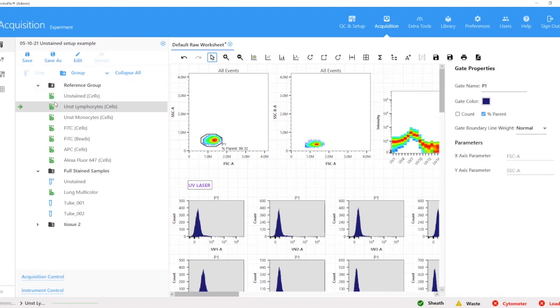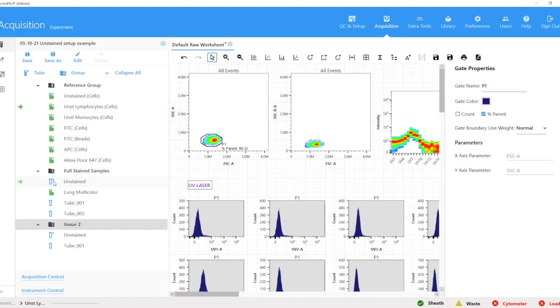You'll also notice that we cannot unmix our data at this time, even though we've filled the reference group. That's because these are reference tubes, and we know that because there's a little R next to them. In order to get to the unmixing, you not only need to record everything in your reference group, but also these tubes that have R's next to them. So these two unstained tubes also need to be recorded. Once you have that, you can unmix your data set.